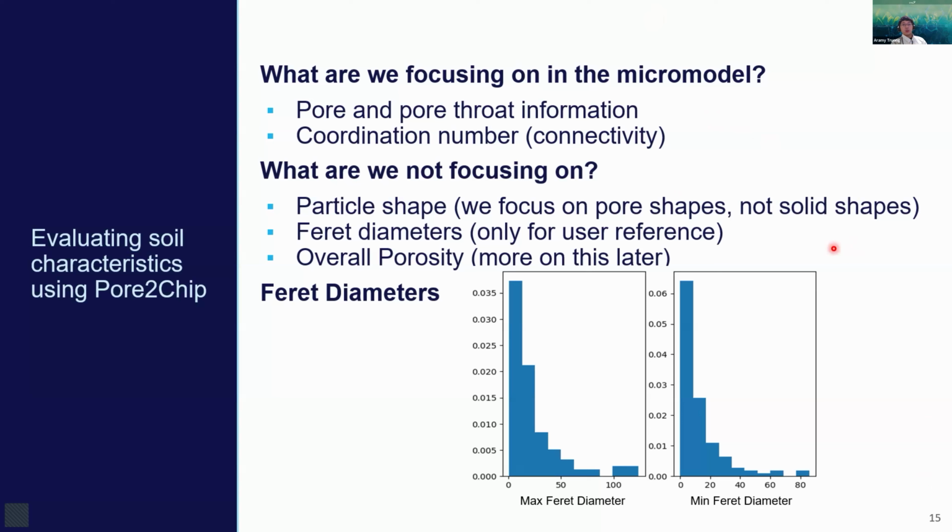So you might have seen some previous efforts to make heterogeneous soil geometries, and it often involved particle packing or sphere packing of solid shapes to simulate maybe a granular structure of soil. And the downside of that is that you don't really have control over the pore connectivity and the pore throat diameters necessarily. You can only change the distance between each of the particulates that you're packing the spheres into.